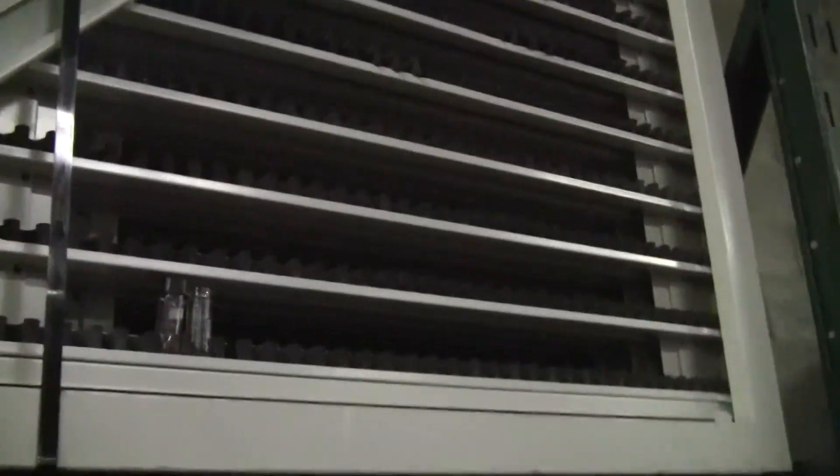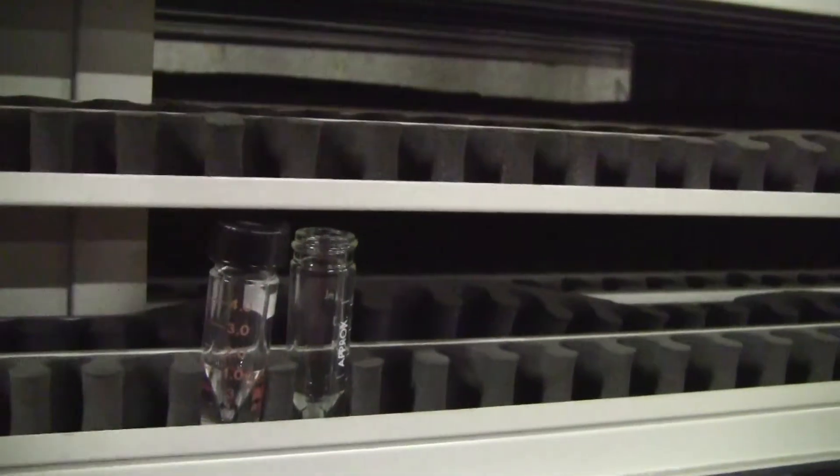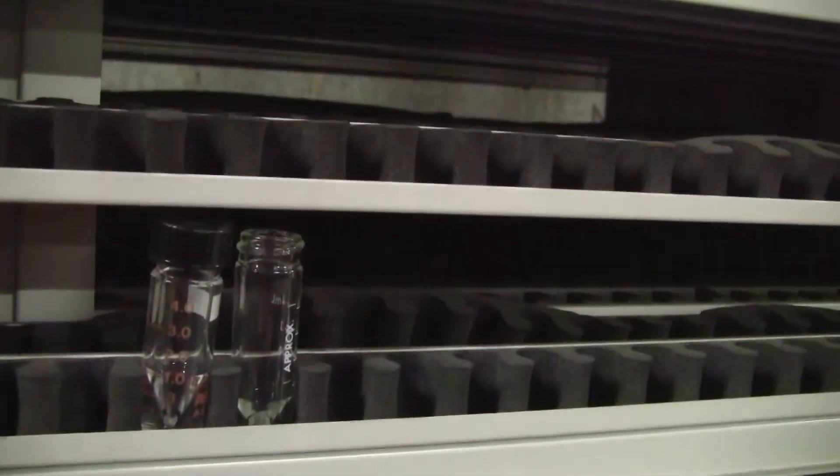It's up high. We're going to take a walk up and take a look at it closer. As you can see, we've put two vials in the racks. They fit into the foam rubber holders. That's a closer look at the racking.